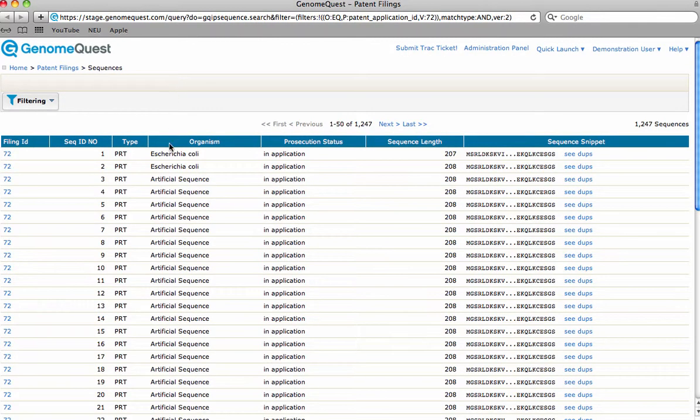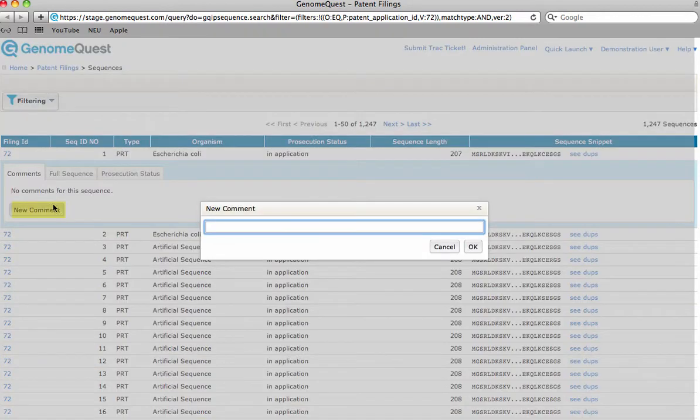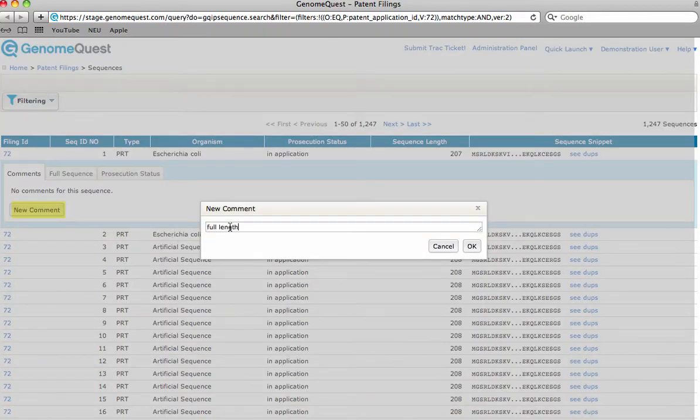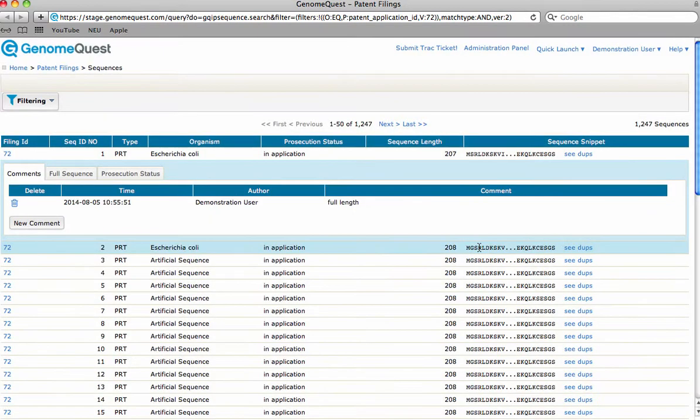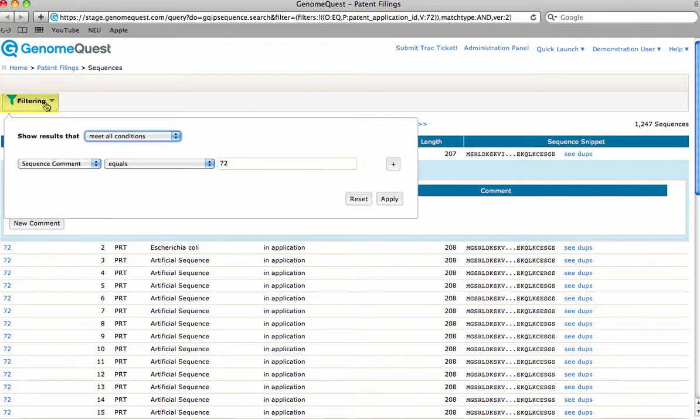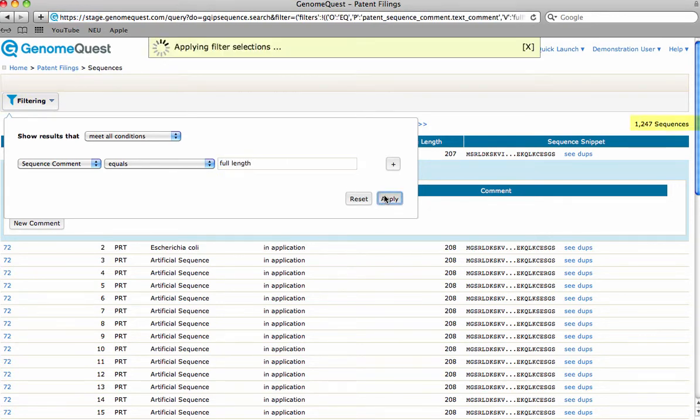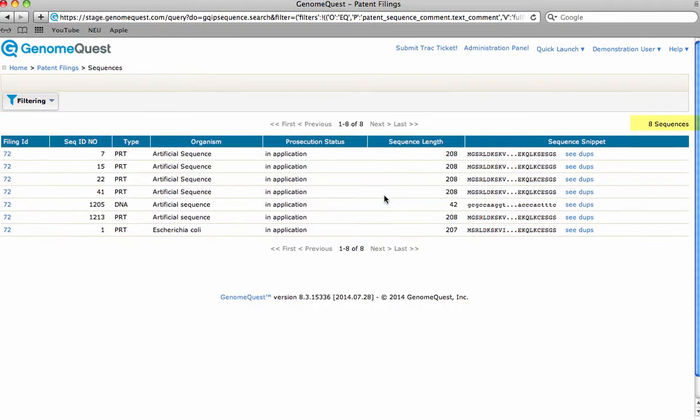Each sequence can be annotated with comments. This particular feature is especially useful when filtering. If I filter based on the sequence comment 'full length,' my results are narrowed from over 1,200 to only 8 - the 8 that I had annotated with the keyword 'full length.'